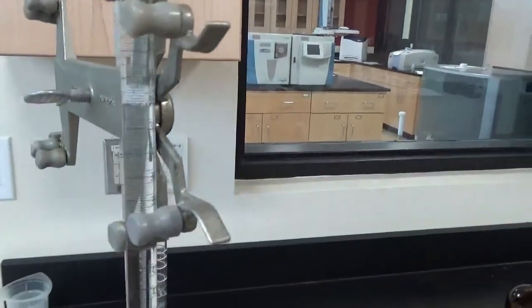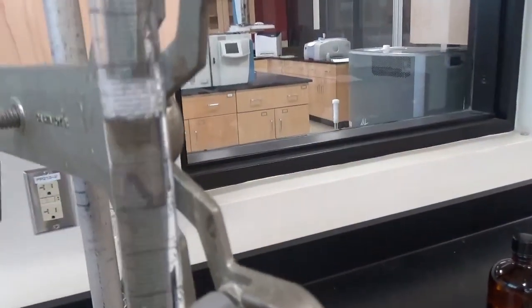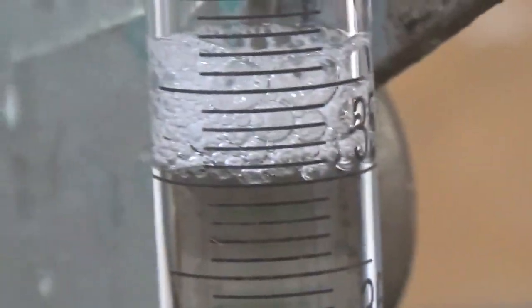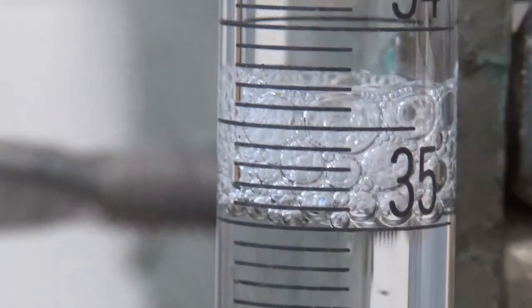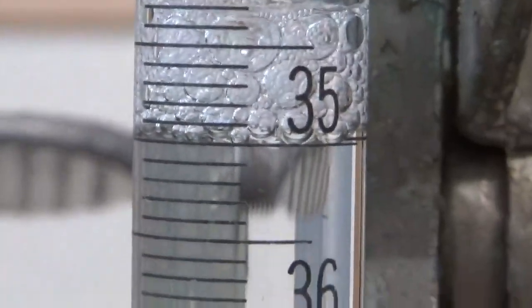So this one I had to go down to 35, but I want to show you that it's really very hard to avoid bubbling altogether. So there are some bubbles there, okay? And so instead of really having a meniscus, you have a bunch of bubbles. And notice that I stopped when the bubbles were at the 35. So it isn't a true meniscus, but I'm doing the best I can. Maybe I should add a little smidge more. I'll take a look at that after I stop holding the camera.